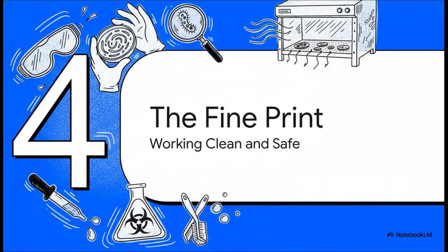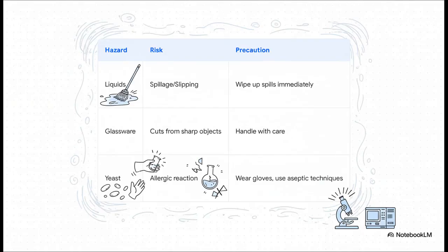Of course, an experiment like this isn't just about getting cool results. Doing good science always means doing safe science. So let's just quickly touch on the precautions that make an investigation like this professional and responsible. Any good lab will have a risk assessment. And it's not complicated stuff. It's really just common sense.